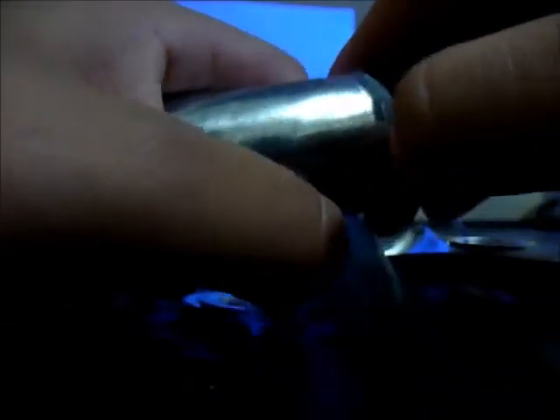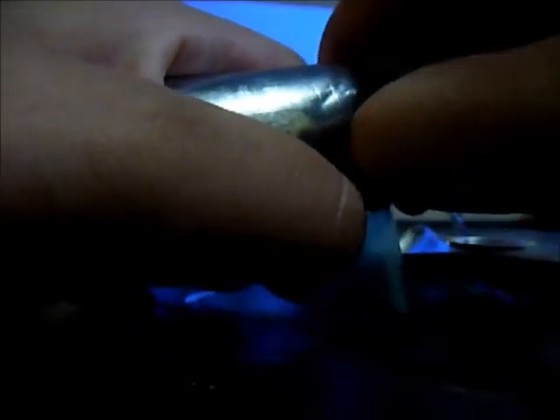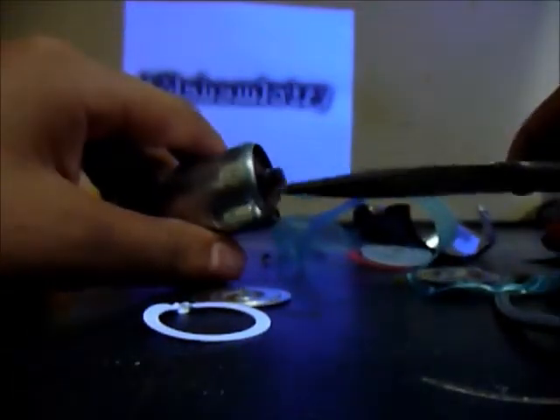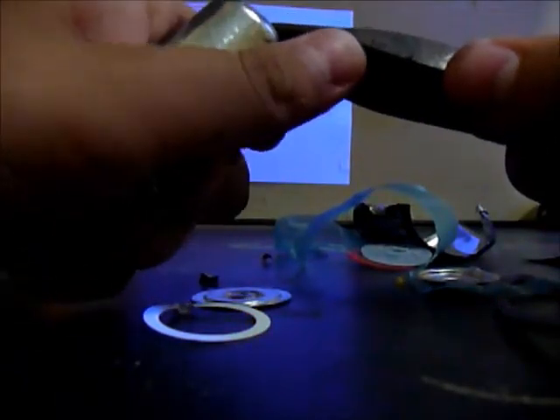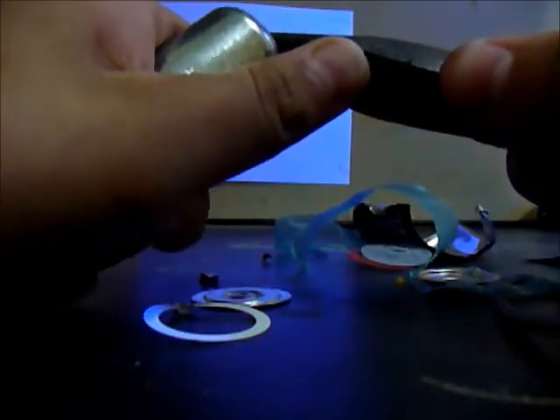And these batteries, well I don't know, but I don't think they shoot their electrodes out, because I've never seen one get hot. So you can just pull the carbon electrode out, and try to do it slowly, but you won't destroy it.